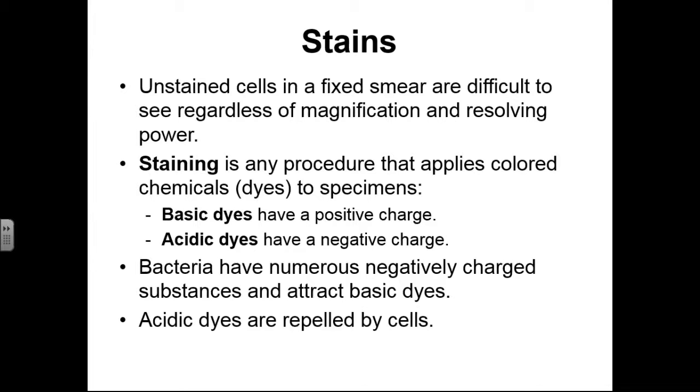We can have basic dyes. Basic dyes, generally speaking, are going to have a positive charge associated with them. And depending on what kind of microorganism you're working with, you'll want to use either a basic or an acidic dye. Acidic dyes have negative charges. If we look at bacteria, particularly gram-positive bacteria, they have lots of negatively charged macromolecules on their surface.